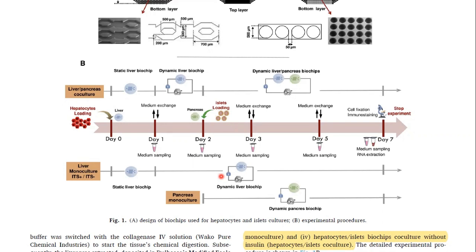The difference between the pancreatic biochip and the hepatocytes biochip is that the hepatocytes biochip culture requires a pre-process that consists in the injection of collagen to ensure that the cells will bind to the bottom of the chip, and the use of the seeding medium. Preparation of the chip is different before the load of the hepatic cells.